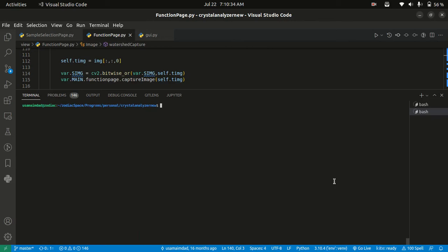Hi, my name is Usama Imdhaad. I will show you a demo of a software built using Python 3 and PyQt 5.